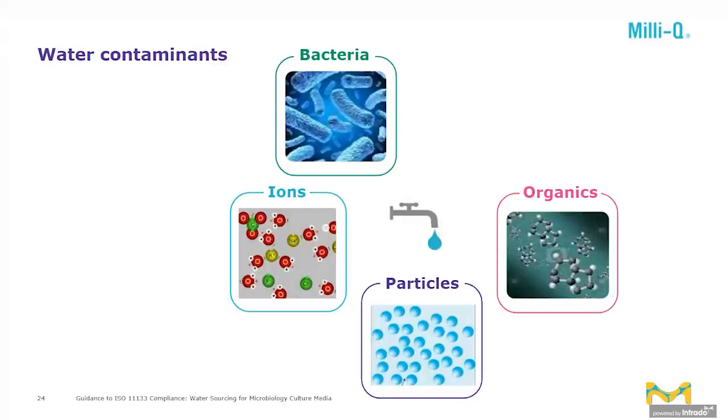Again, since there are some very strict regulations about tap water, those levels should be very low. But still, they may be high enough that it could impact the preparation of your media. It could maybe cause some precipitation or some change in color. We were just discussing this earlier. So that could be the reason, along with ions, of course.